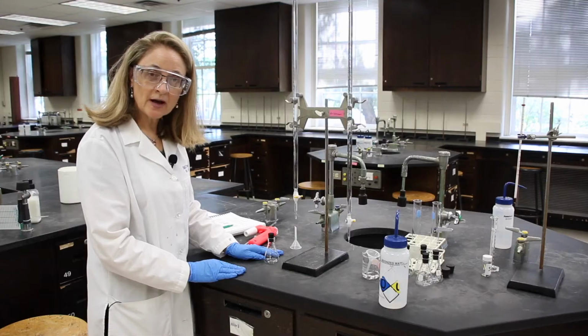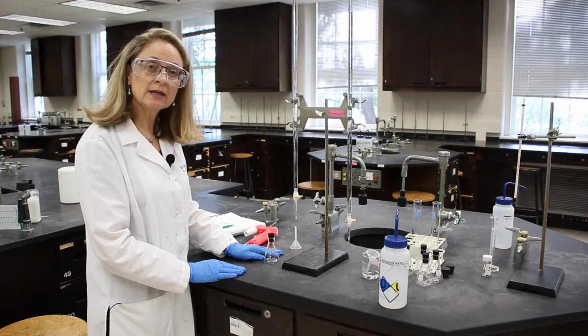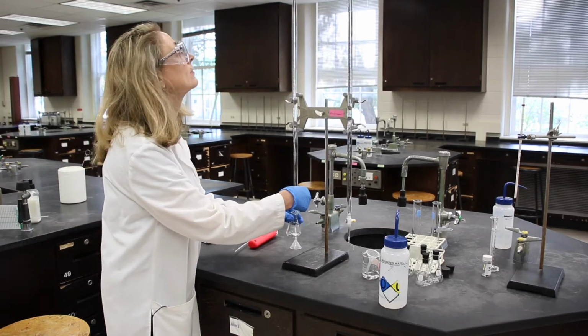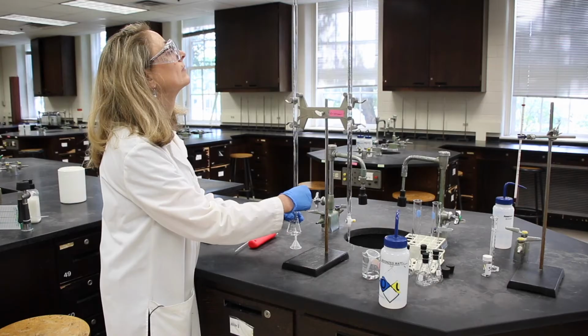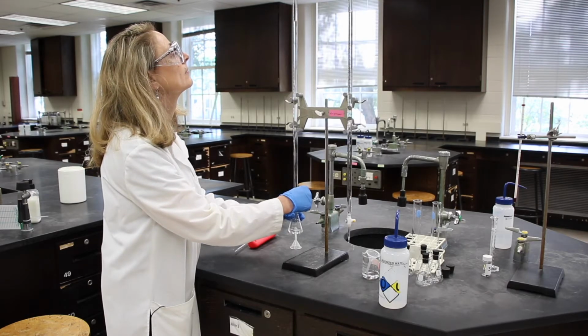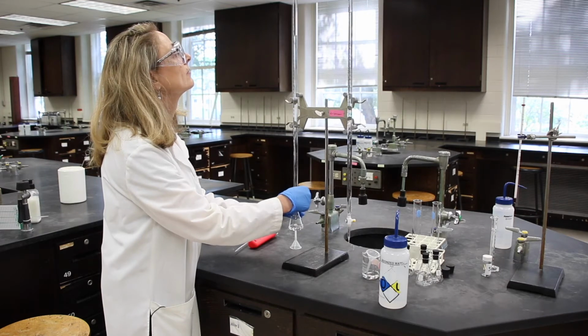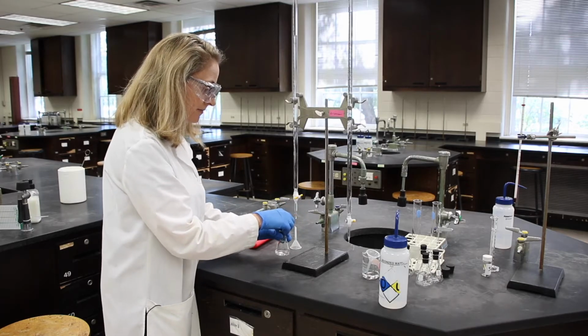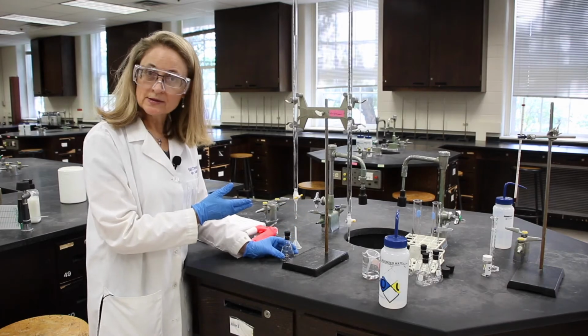In step 5, we'll dispense approximately 10 milliliters of DI water to this flask. I'd like you to read this burette reading.